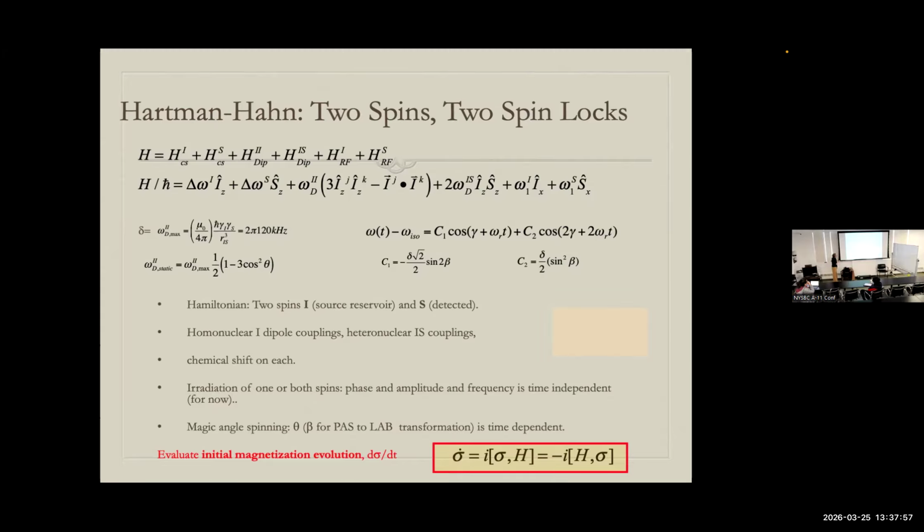I just reminded you that this is how they look. But sometimes you just see the IZSZ, and sometimes you see this whole thing, I dot I and IZSZ. Why is that? How come half the time when we put up a coupled Hamiltonian, we just say IZSZ, and then sometimes we have this whole thing that I have there? I'm going to use this whole thing. It's going to matter that I have the whole thing in a later step.